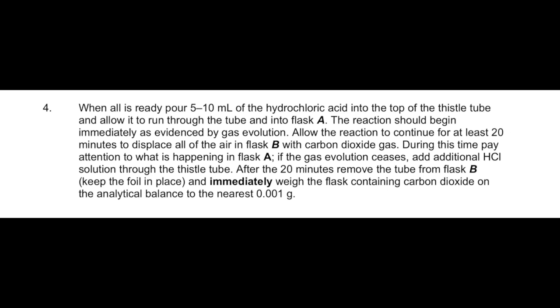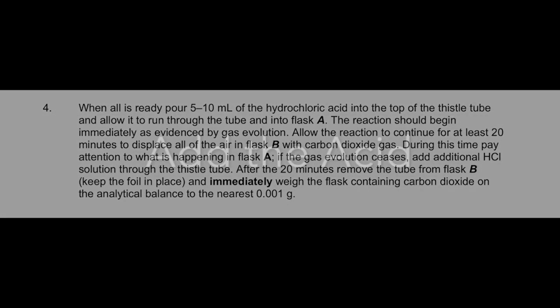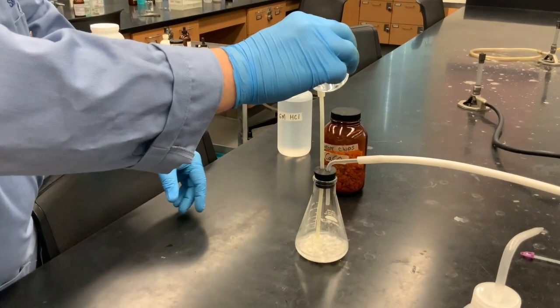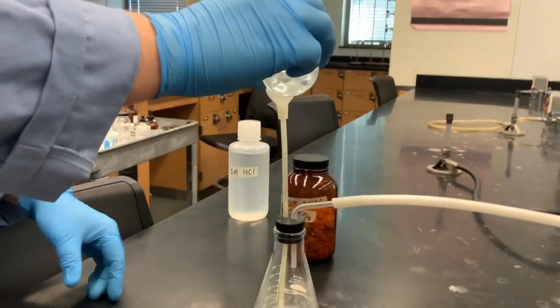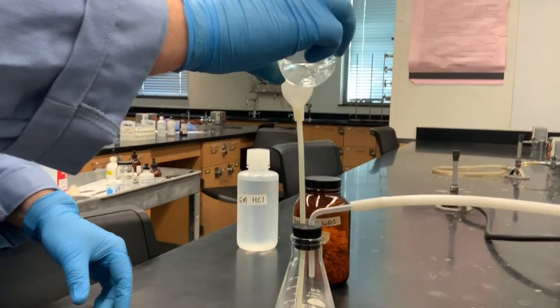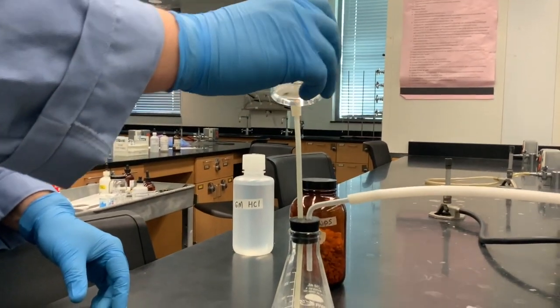When everything is all set up we're ready to deliver our acid through the thistle tube. The acid is going to be poured carefully down the thistle tube into the flask and the CO2 begins to form as the acid hits the calcium carbonate chips.